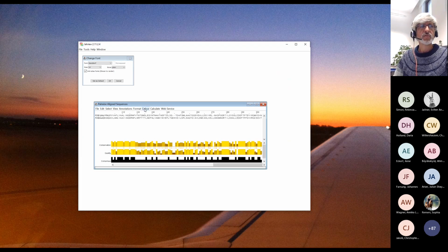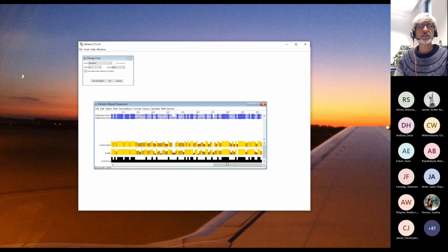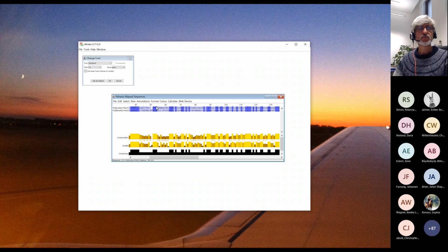Okay. And then if you color this, it can help you see identical residues and similar residues. So in this case, we have identical residues colored in dark blue and a lighter color for ones that are not identical but similar. In this case, because we have two sequences, we have all of them colored, but the blue one is indicating the identities. And so now what we want to do is to contrast these two sequences regarding their structure.